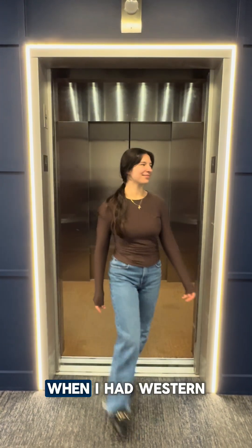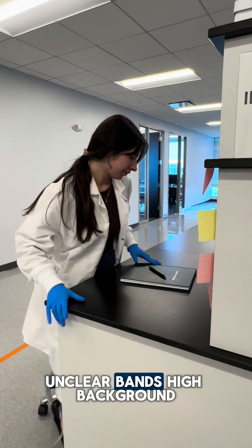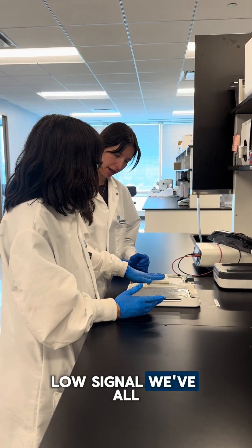I remember tough days in the lab when I had western blots that just wouldn't go my way — unclear bands, high background, low signal. We've all been there.